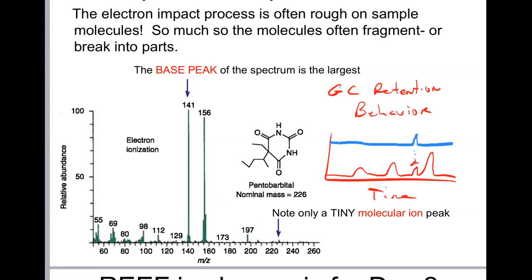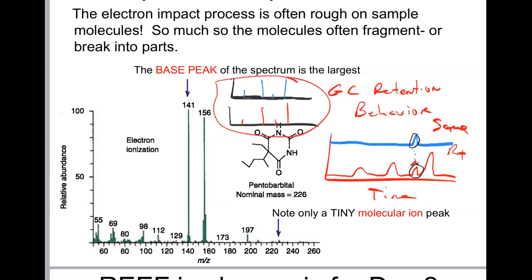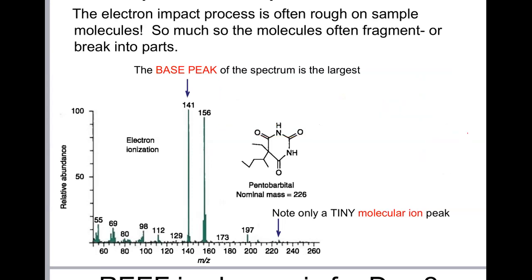Now, if you take the data from the mass spectrum for both of these, and for the known sample, you see a mass spectrum that looks like this, and then you run the same experiment for the unknown sample that you got from the athlete that you suspect of doping, and you get something that looks like that, it's the same, right? So you got the same retention time, same fragmentation pattern. Well, that guy, or gal, might be in a little bit of trouble. It seems like maybe they're guilty of doping in such a case, because you got so much chemical evidence, the same fragmentation pattern, same retention time. That's pretty strong, convincing evidence to an analyst that that substance was really present in that athlete's blood.